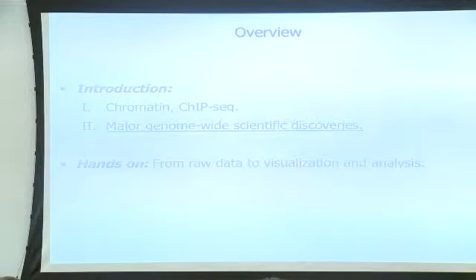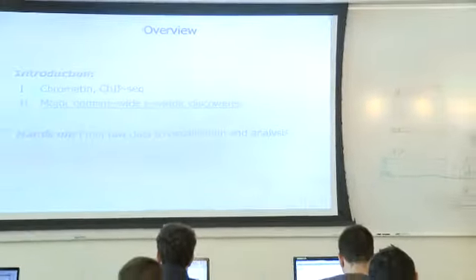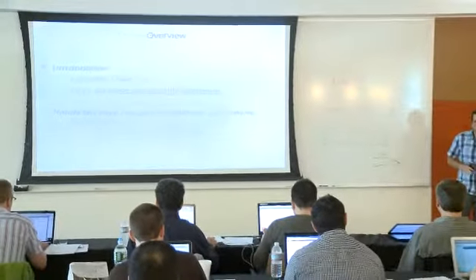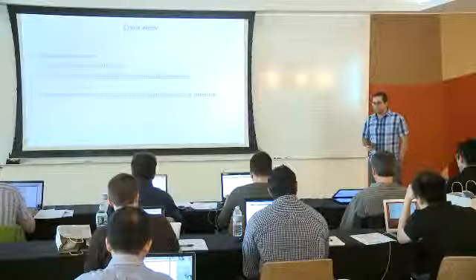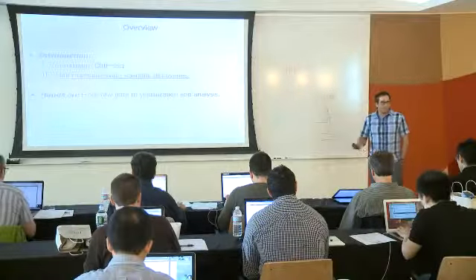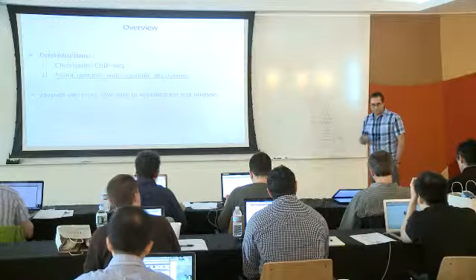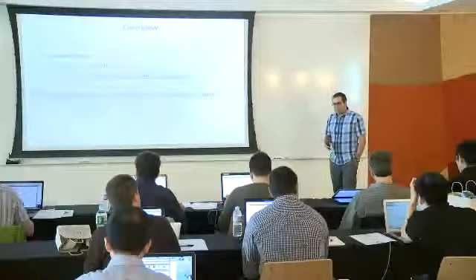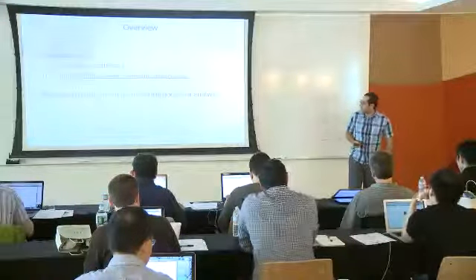And then most of the time, I want you all to go through the workshop that I've sent you and gave you some sheets for it. Thanks. And the good news is that the GenePattern seems to be working. I'll talk and we'll start working for the next hour or so, and then we'll take a break. And during this break, I'll print out the GenePattern, which will be part 3 of what you're doing. And it will allow us to do some scatter plots and correlation matrices.